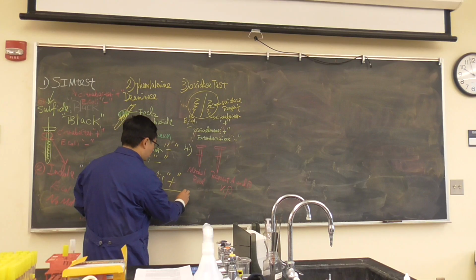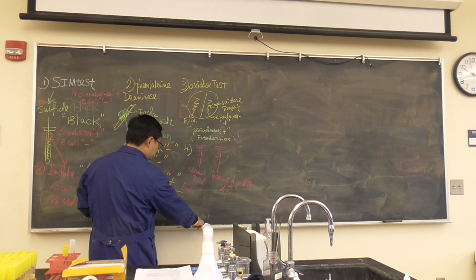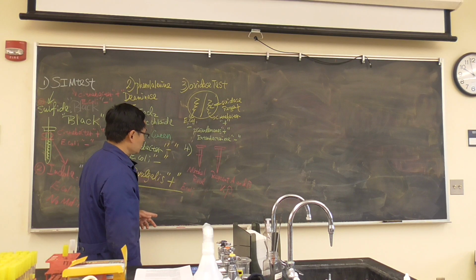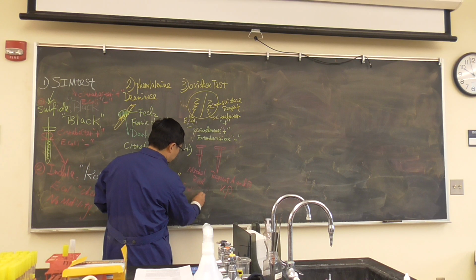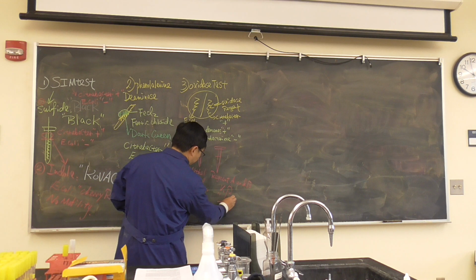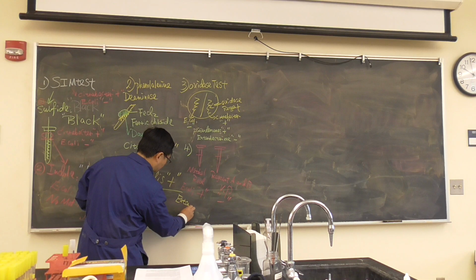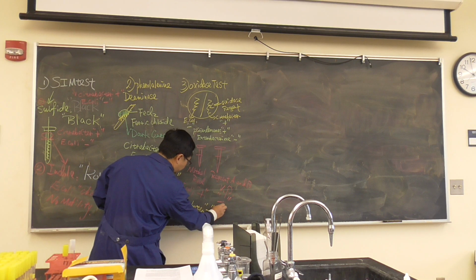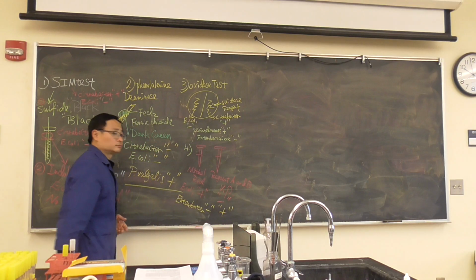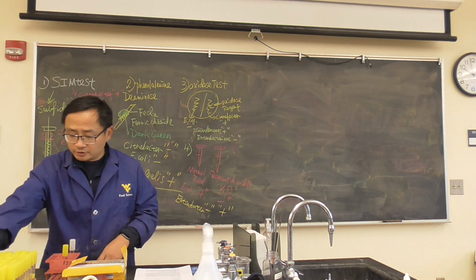Now for E. coli, you should see the methyl red is positive. So E. coli methyl red is positive, VP is negative. And for Enterobacter, this is negative and this is positive. Ideally it is like that. I'll find a reagent for you.